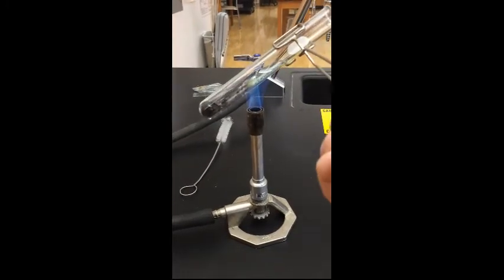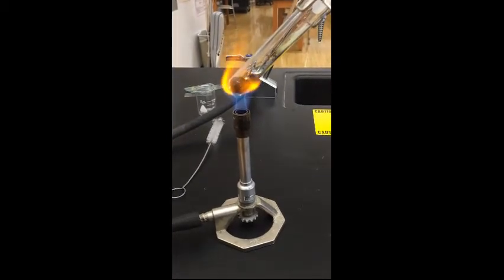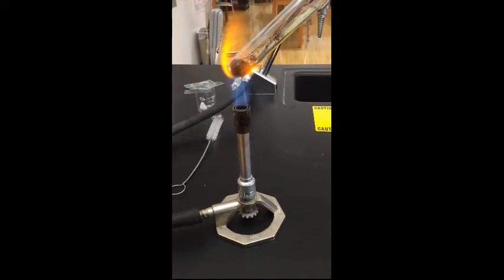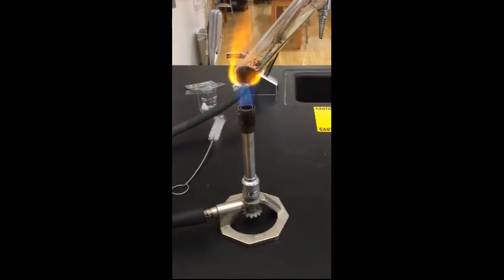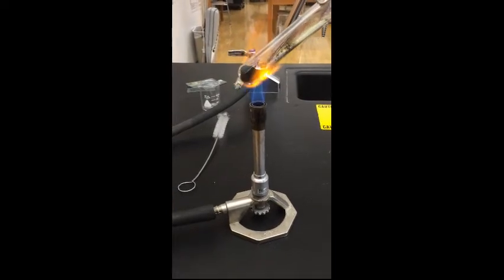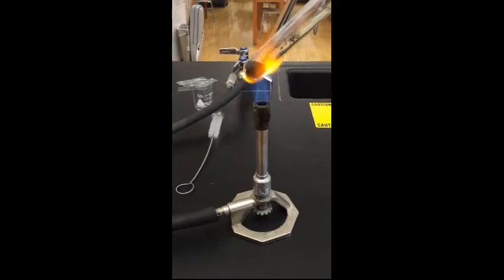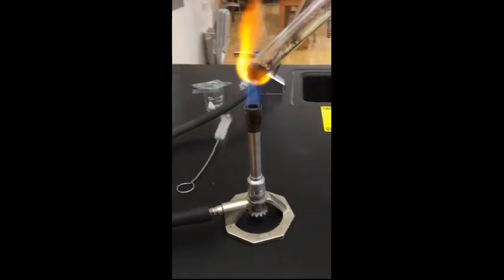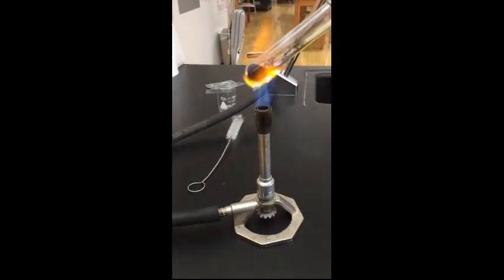Okay, the green color is gone, and it's basically turned into dark brown / black. Now this is a decomposition reaction. So we start with the copper 2 carbonate, and we end up with carbon dioxide as a waste product here, as an end product.